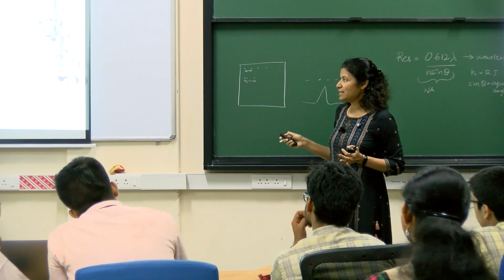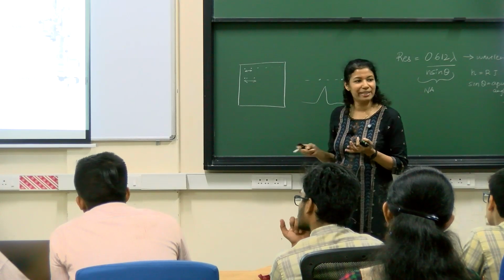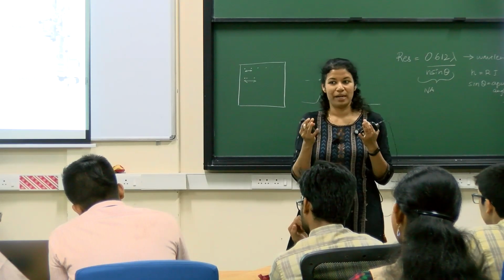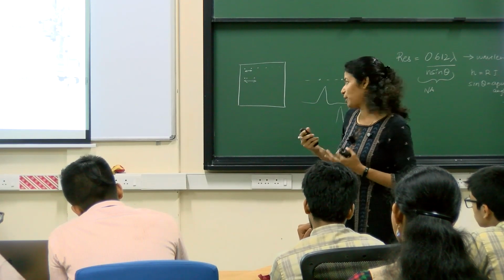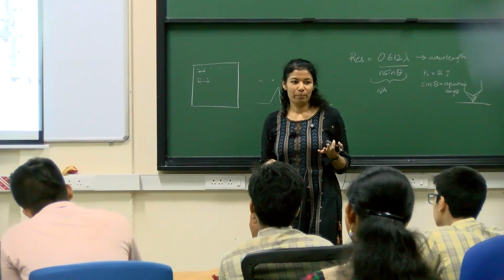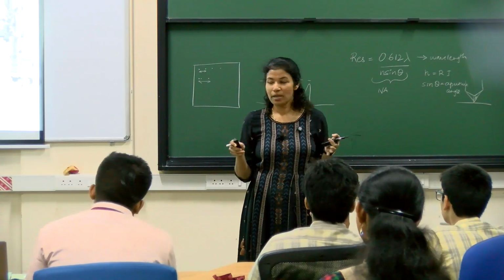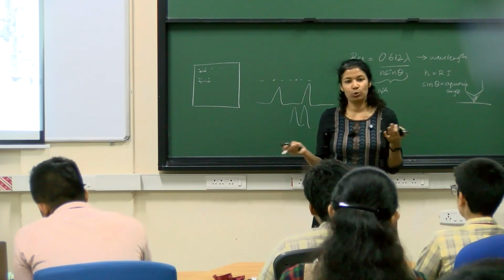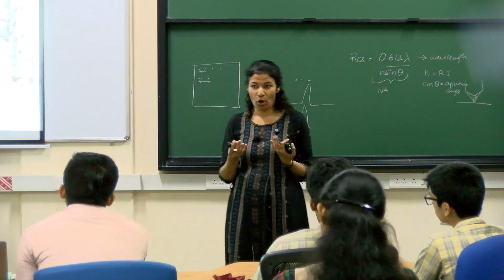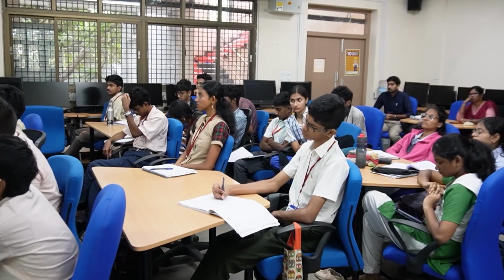The principle is the same. You have an illuminating source, your sample is there, and then you have a place to detect it, like your image, okay? I'll go into more details of how it is different when you're using a light versus electron microscope. But what I want to show you is that magnification wise, you can now go up to 100,000 to 200,000x. So it is very high magnification, and very routinely you can get 2 to 4 angstroms of resolution. I'll show you some structures as well that we've gotten of viruses, of inside the cell, and how you can very easily image this nowadays.